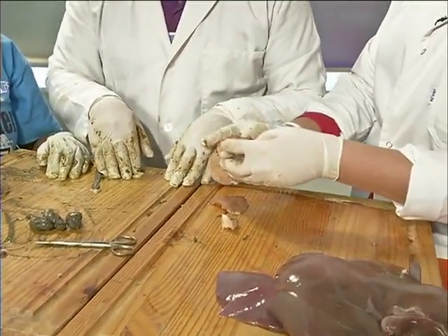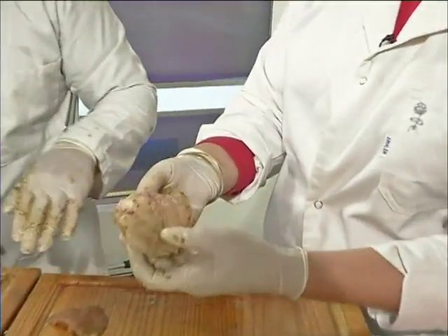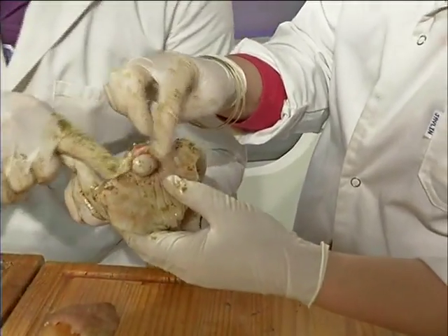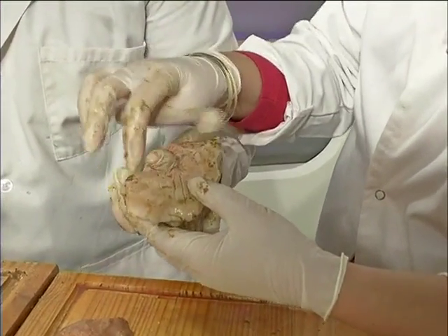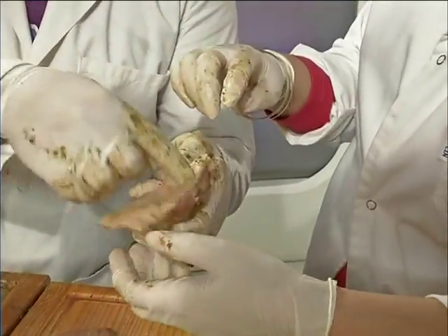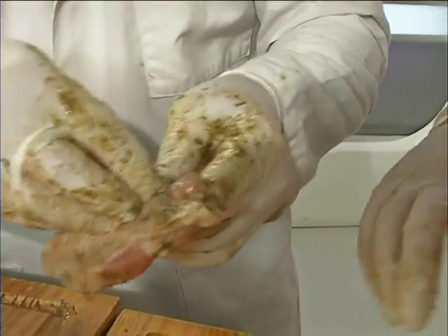Go on, stick your finger through there. I know you want to. Right there it is. That's the part where the large intestine comes through and ends up. So this part there is a sphincter, and that's the anus. Is this part behind it where the muscle is the anus? This is a sphincter. The sphincter is on the last part of the anus. It closes the anus.